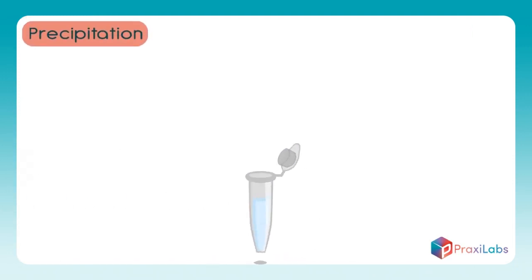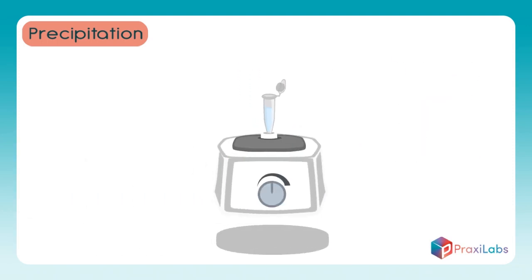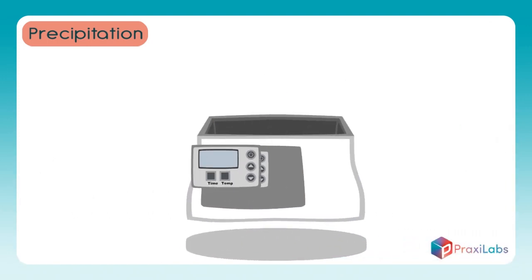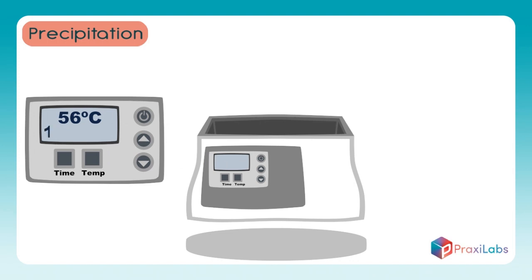The second stage: Precipitation. Add 10 microliters of Proteinase K enzyme and mix it with the sample several times with a pipette. Mix the sample well with the mixer for 15 seconds. Avoid creating bubbles in the sample. Place the sample in the water bath at a temperature of 56 degrees centigrade for 2 hours.